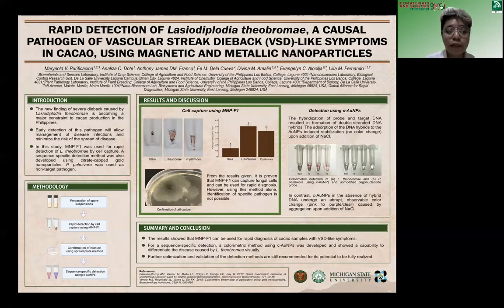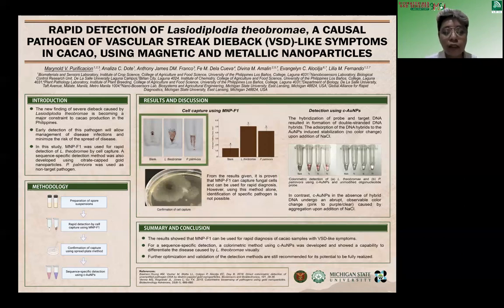Blank and spore suspensions of target and non-target were mixed with MNPF1 and incubated for 10 minutes before placing in a magnetic rack. After the magnetic separation, images were taken and analyzed using ImageJ software to determine the matting area in the presence and absence of spores.